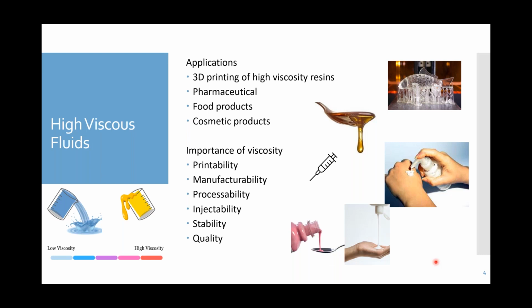High viscosity fluids are utilized in different applications. Recently, the interest in additive manufacturing of high viscosity resins is rapidly growing because of the wide range of potential applications and also the higher quality and better mechanical properties of the printed parts. In biopharma, it's been reported that the interest in developing high viscosity therapeutics, peptides, proteins are growing as well.